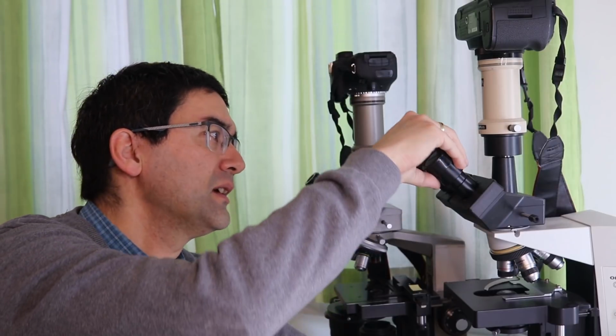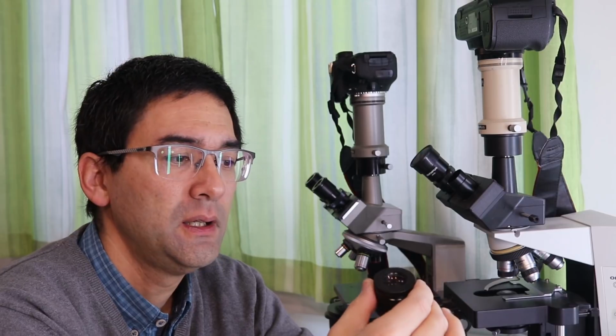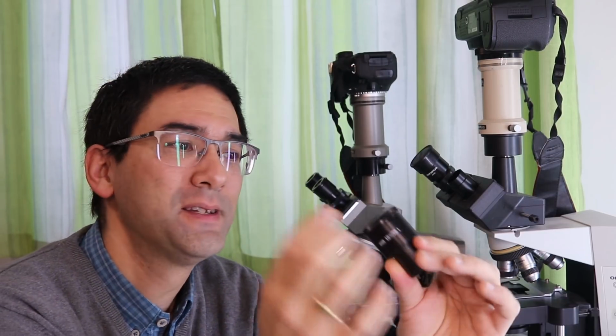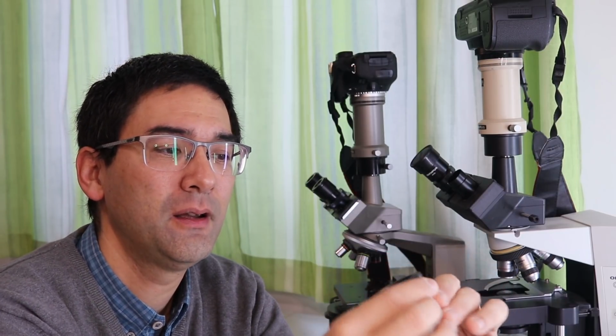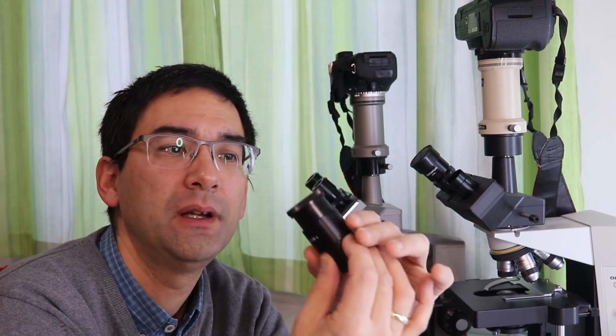Okay, so what's another thing? Another thing is the so-called eye relief. I'm going to take this out. These are pretty good and expensive eyepieces, obviously. If you look at it carefully, you're going to see that there's an interesting thing that you can extend here, and you're able to pull this out.